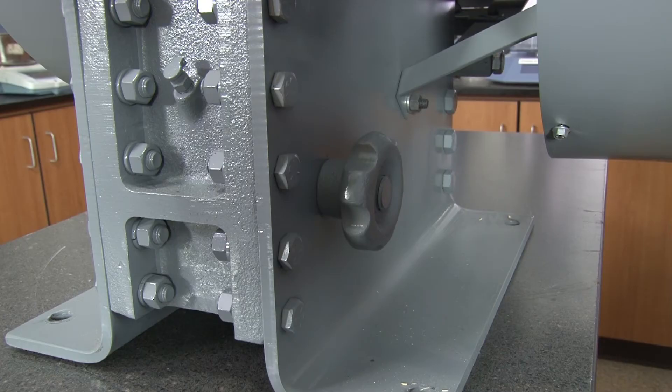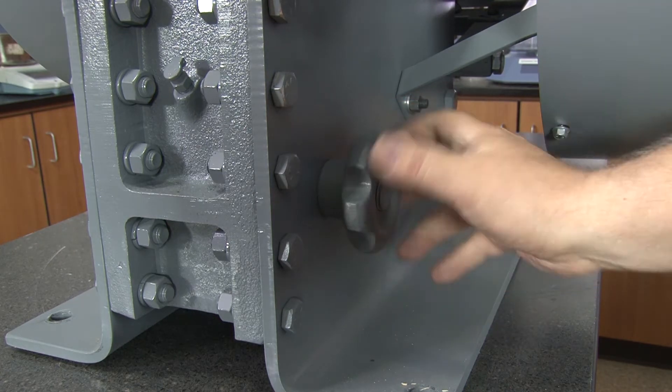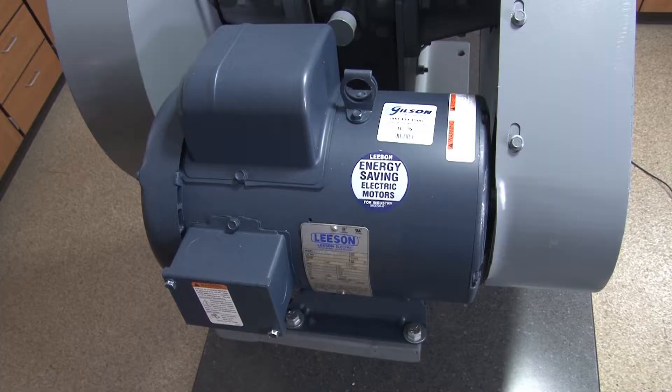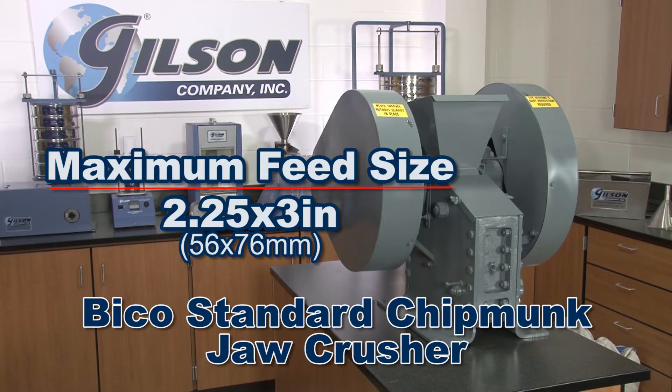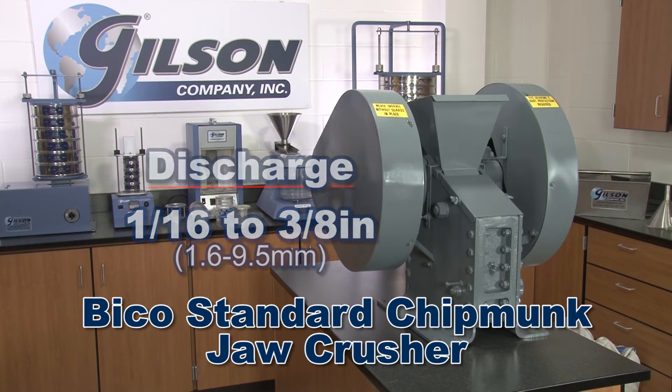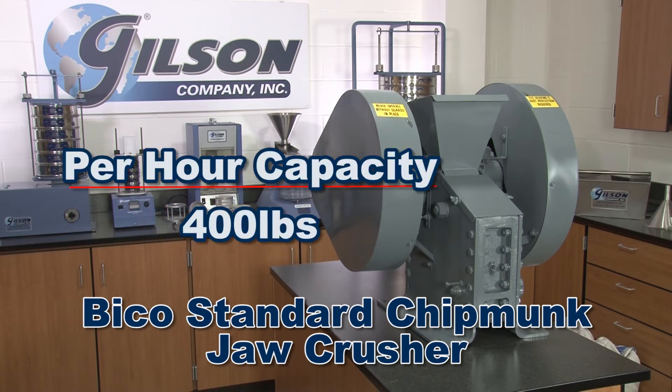The discharge opening between jaws can be adjusted by turning the crusher's conveniently located hand wheel. Utilizing its 2 horsepower motor, the maximum feed size is 2¼ by 3 inches, crushing material to 1/16 to 3/8 inches with a 400 pound per hour capacity.